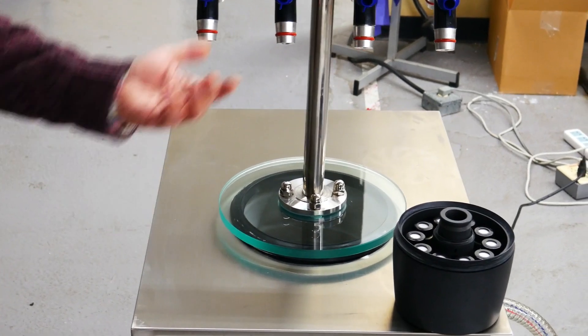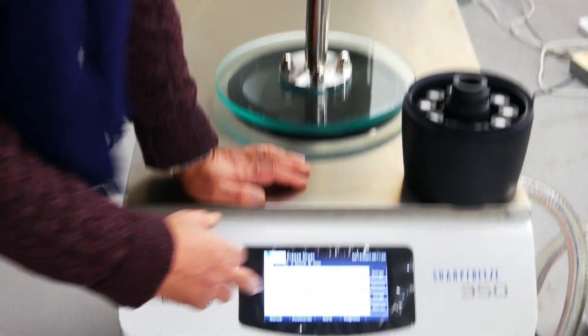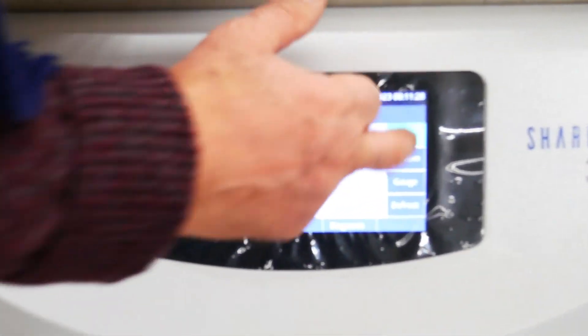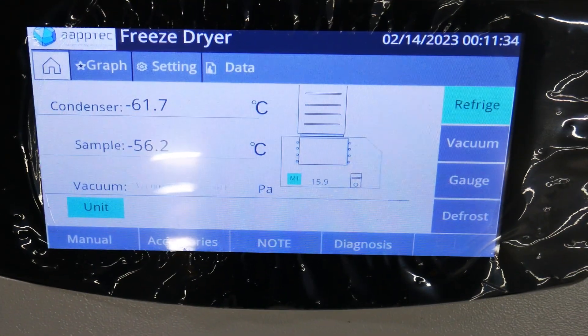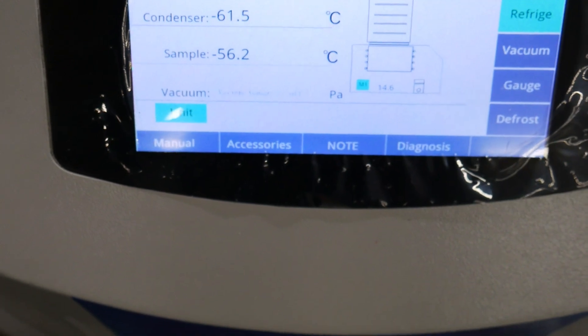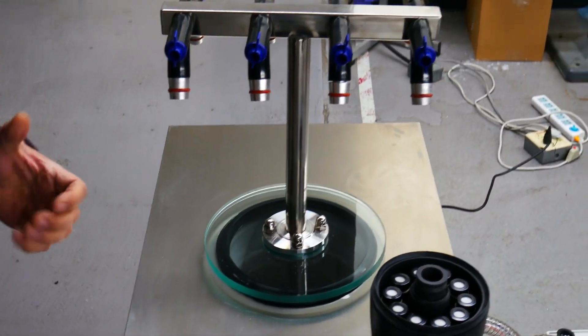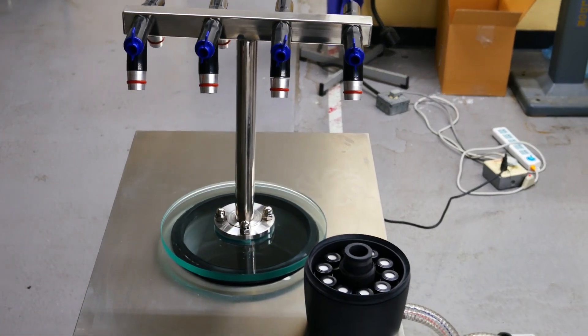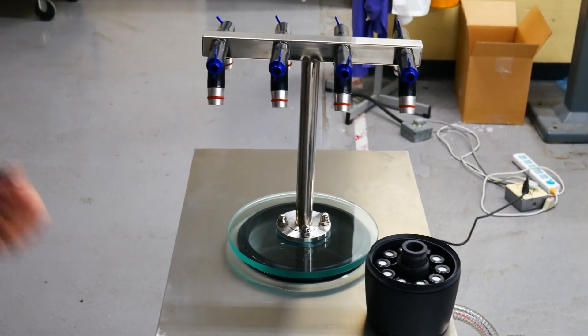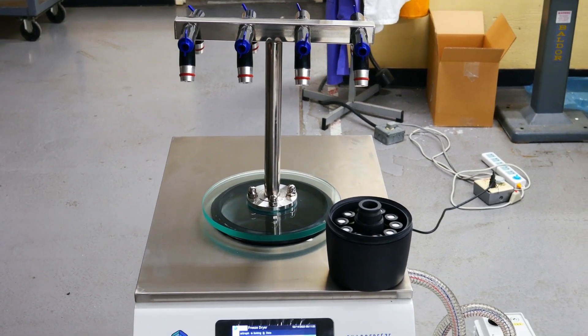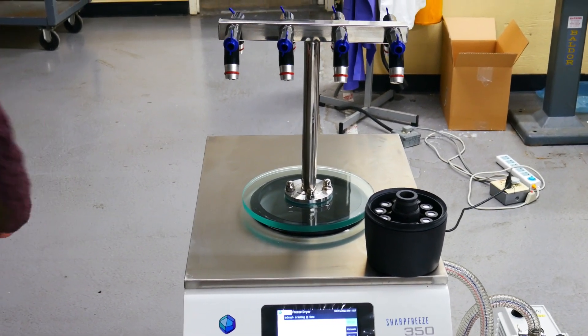Another advantage of the SharpFreeze is that you can freeze your sample inside the chamber. First, you turn the system on and turn on the refrigeration. So now, refrigeration comes on and the temperature goes down to what you set it. Now, you place your sample inside the chamber and you freeze it before you freeze-dry it. So, you do not need dry ice or anything else. You can use the SharpFreeze to do both. Freeze the sample and freeze-dry it.